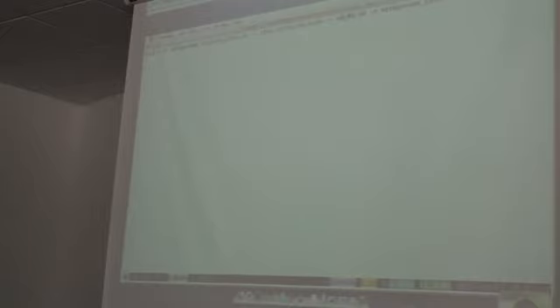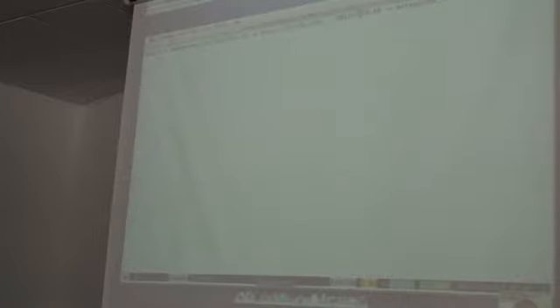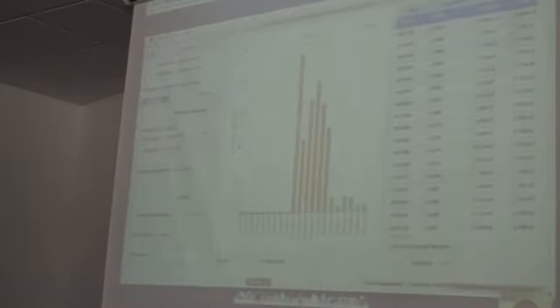Here we would specify what K orthologs we're interested in. You can leave it as default, as nothing, but the table gets really, really huge. So the recommendation is to pick out a few K orthologs that you're interested in. So here we could pick out K01727. So change windows, K01194. And so on. So you could list a few different ones here. Again, we would let this run.